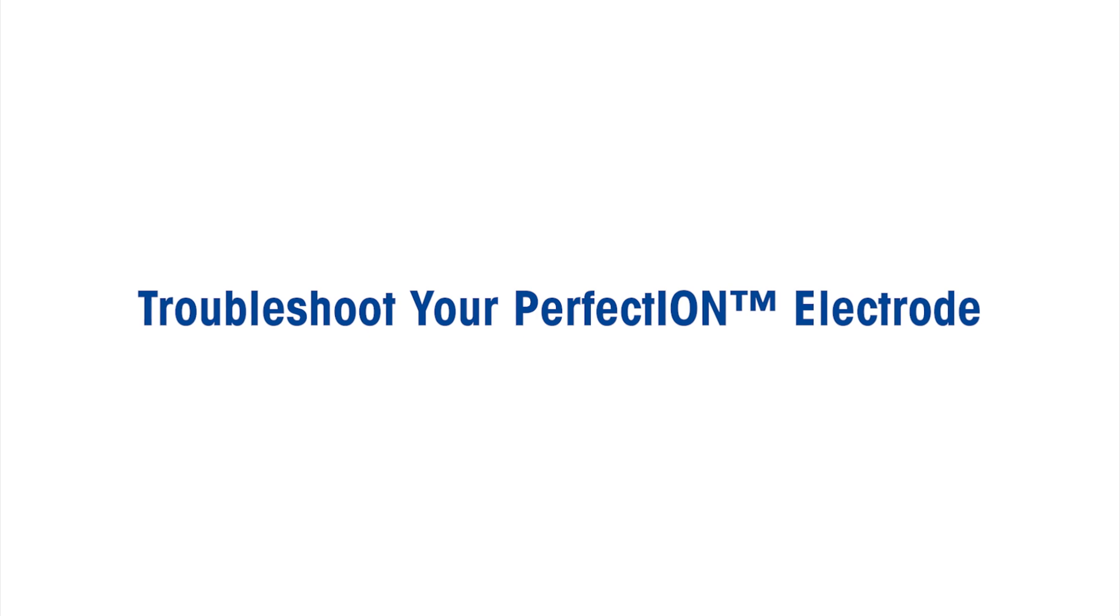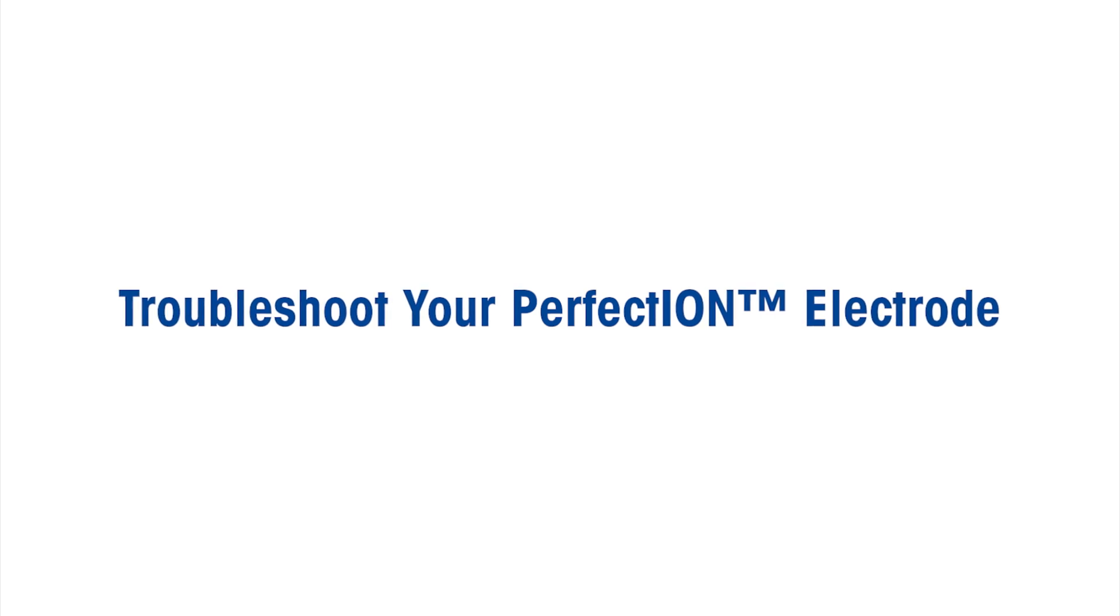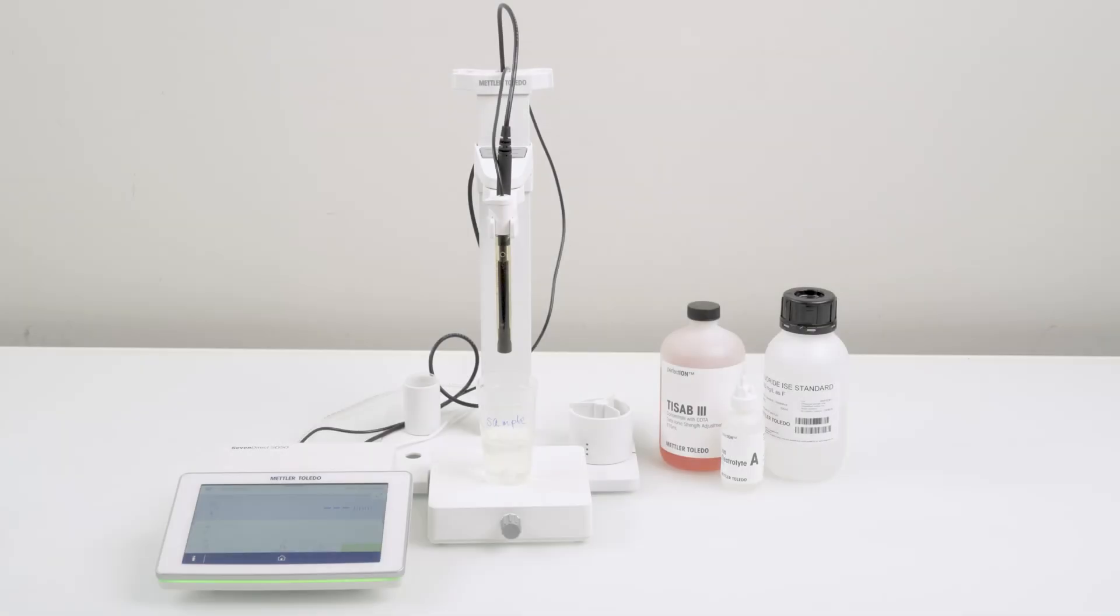Welcome to ISE sensor video. In this tutorial, we will take you through a step-by-step process to troubleshoot your PerfectION electrode if calibration fails. Let's get started.